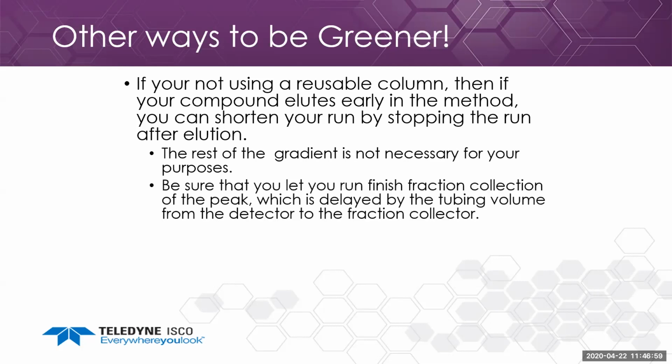The one thing you'd want to be sure of is that you let the run finish fraction collection of the peak, which is obviously delayed because of the tubing volume from the detector to the fraction collector. So just let it run for about a half minute after the peak comes out or is done coming out.